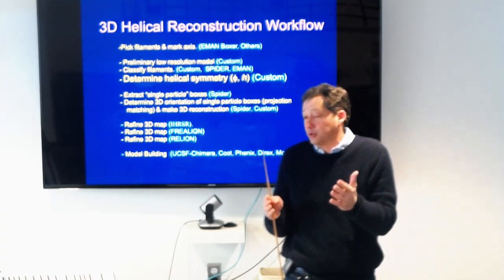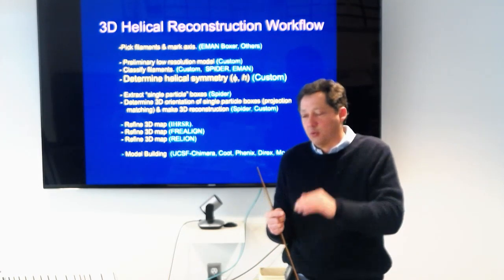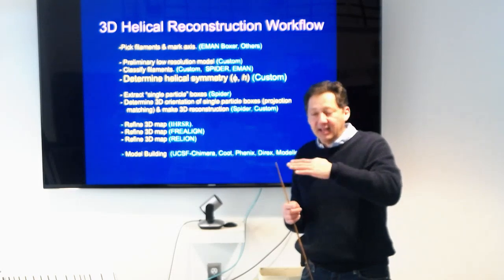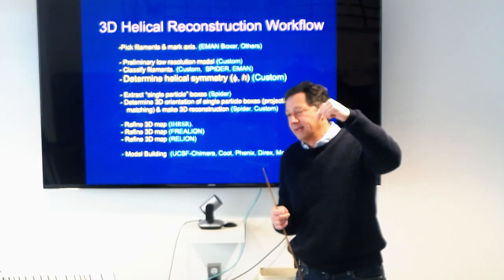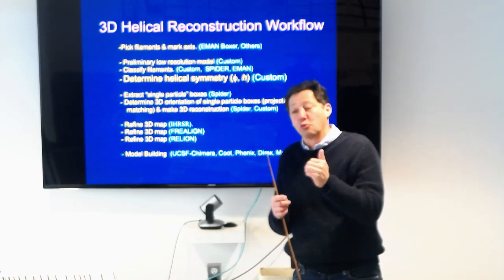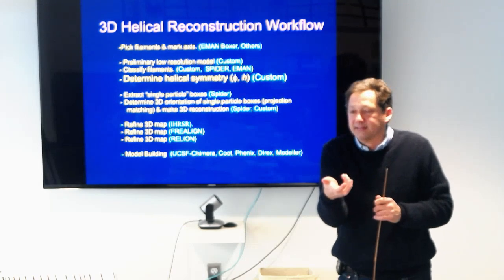The other thing when you do helical reconstruction, because we do microtubules, is that we can apply the symmetry that we want. For example, we can choose the ideal helical path that goes through every single subunit. But we may have a seam, so instead we choose one that goes along a protofilament. So we treat the whole microtubule as if it were my asymmetric unit.